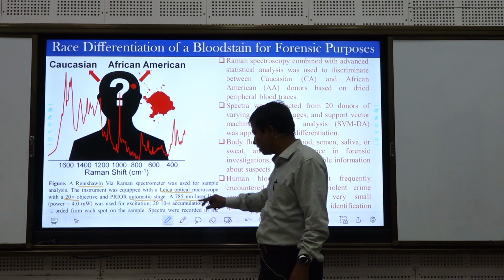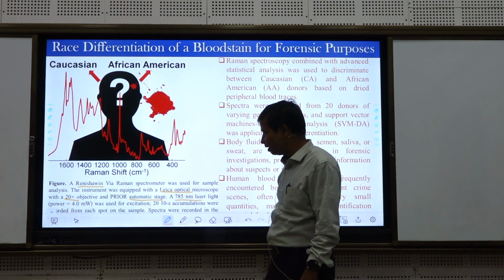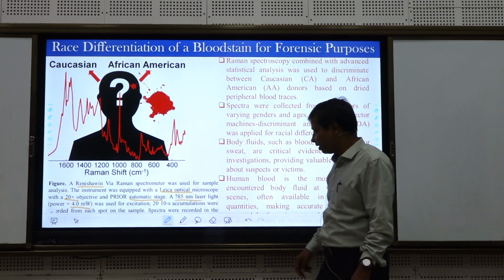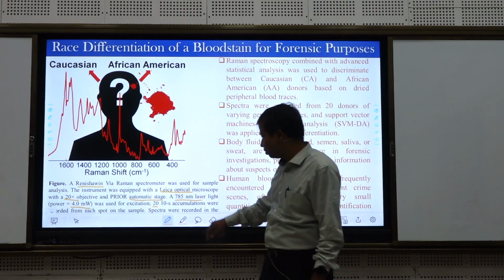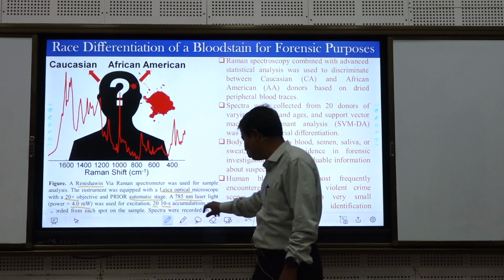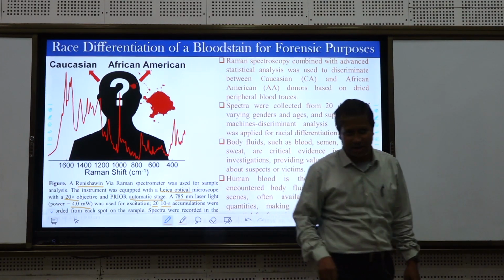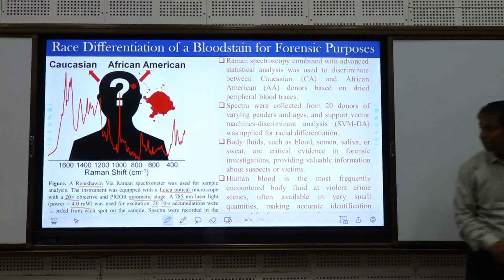The excitation radiation they have used is a 785 nanometer laser light. Power is 4 milliwatt. A 10-second accumulation time was used, and I think 20 samples, 20 times, were recorded.